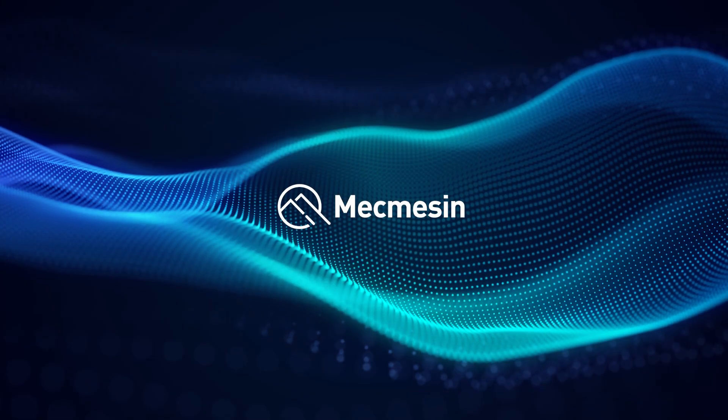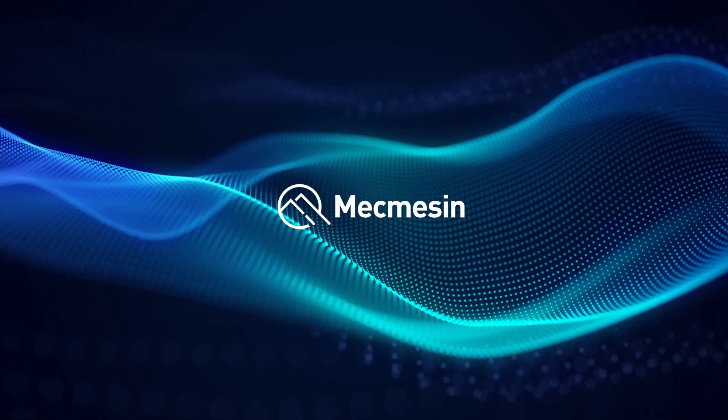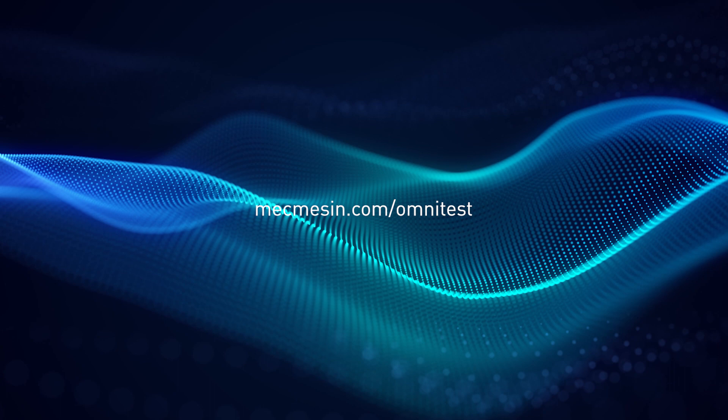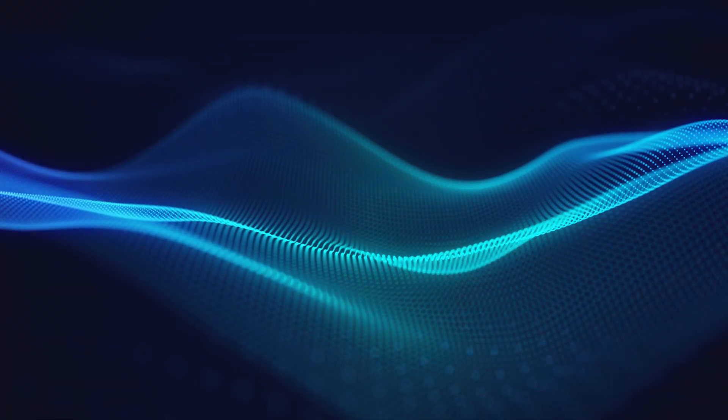Configure your Omni test online, visit mecmesin.com/omnitest.